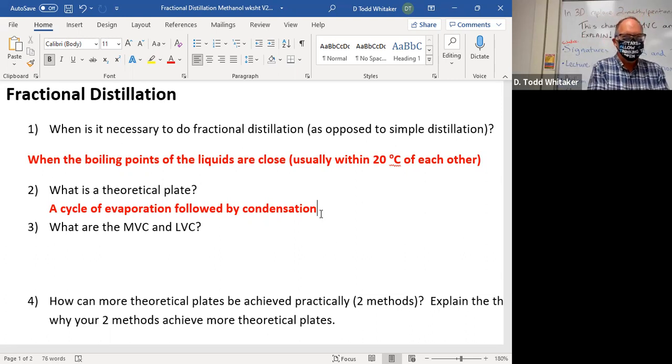So that's happening. So where do these vapors go? When they're created, you're boiling in a flask. The liquid's down at the bottom and the vapors go above that, right? We saw that last week. And you actually saw them then condense down back into the flask. You saw this. I made you look for it, right? So you were seeing at least one cycle of evaporation and condensation. Maybe more, you can't tell.